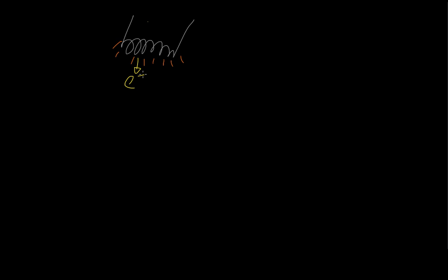So this thing is throwing out electrons. And if we happen to have a molecule in the way of this, with its electrons orbiting the molecule, if we knock one of those electrons off of it, then we will charge the particle.